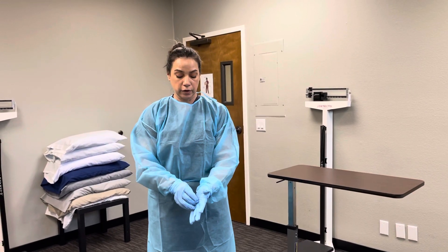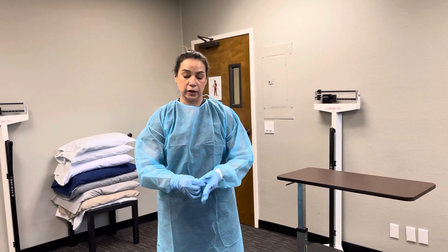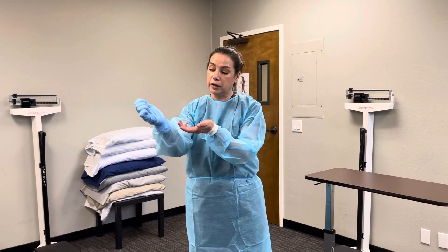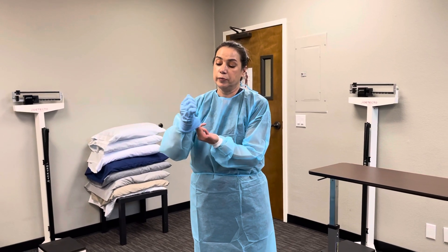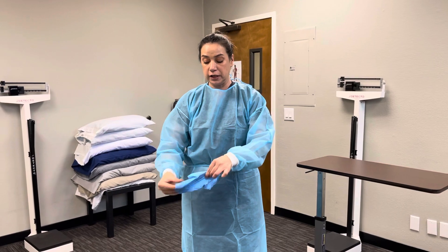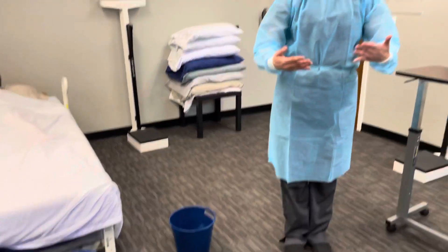Now I'm going to remove the gloves. I'm going to grab the glove at the palm, peel it off with the other glove, then I'm going to put two fingers under the glove and remove it without contaminating myself, and place it in the designated trash area.